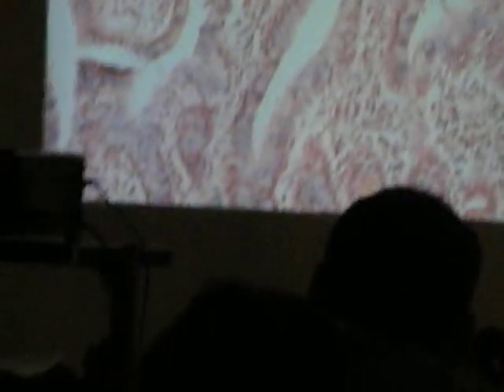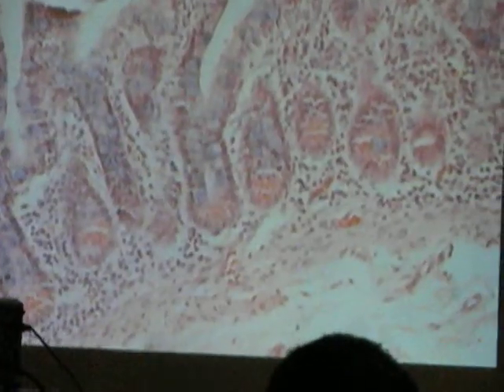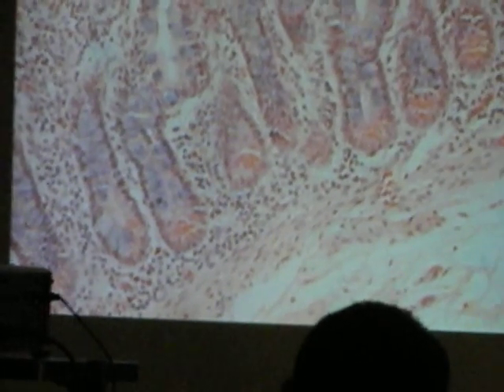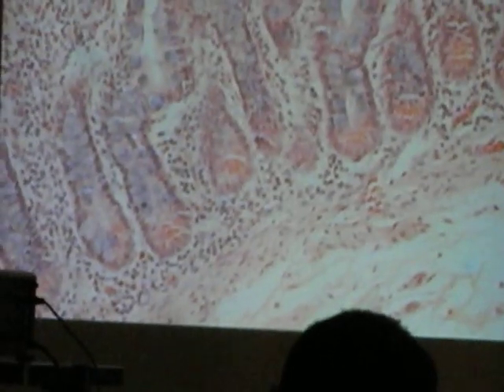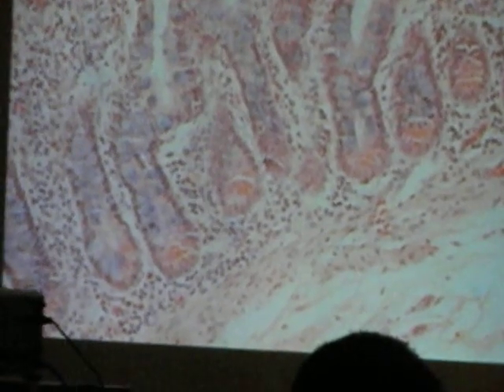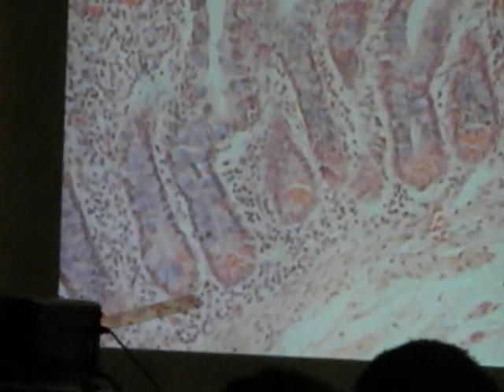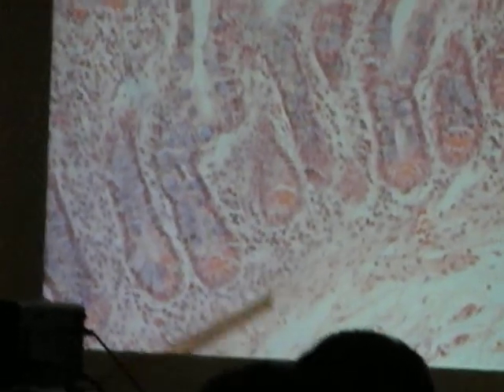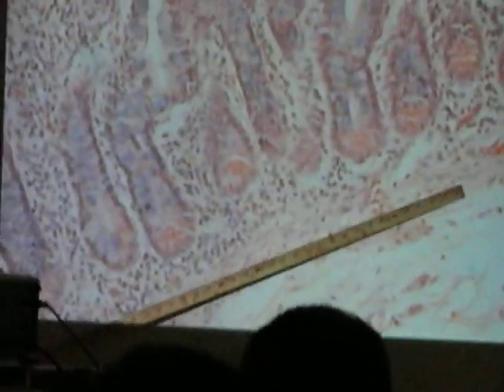And then down towards the bottom, you would have your intestinal glands, the crypts. That's all of these, those that do have goblet cells in them, and then we have our muscularis mucosa layer.